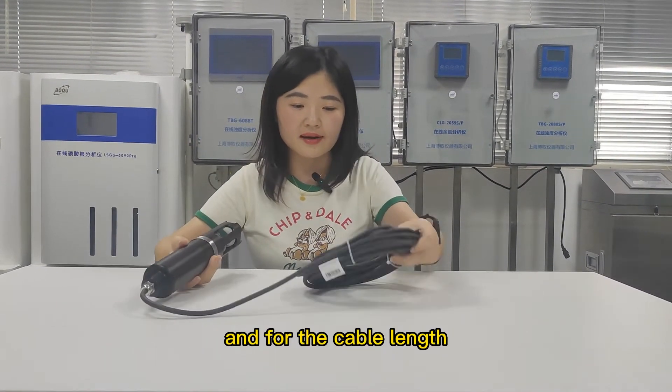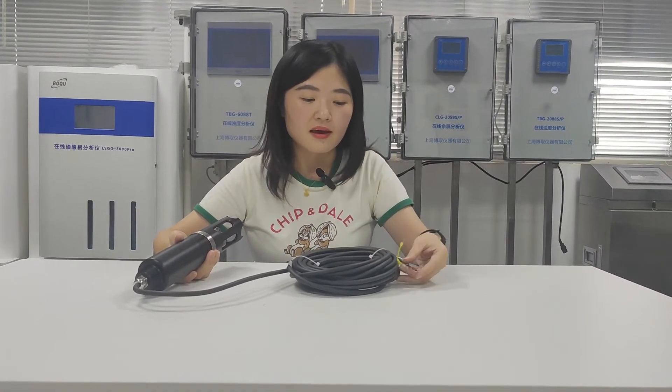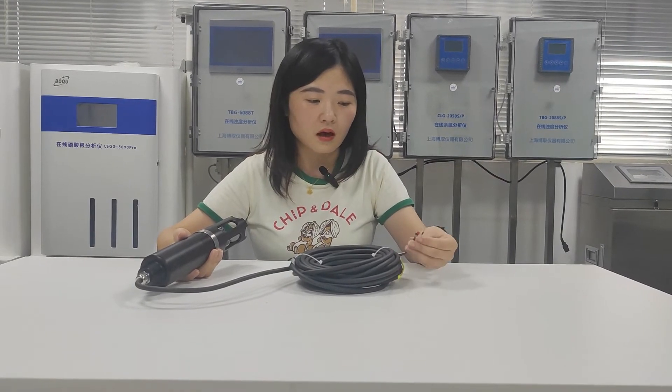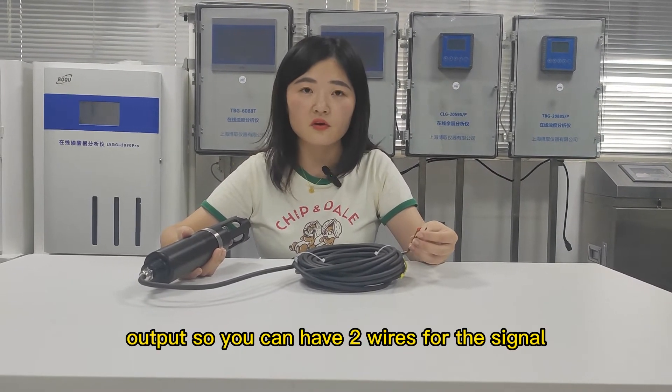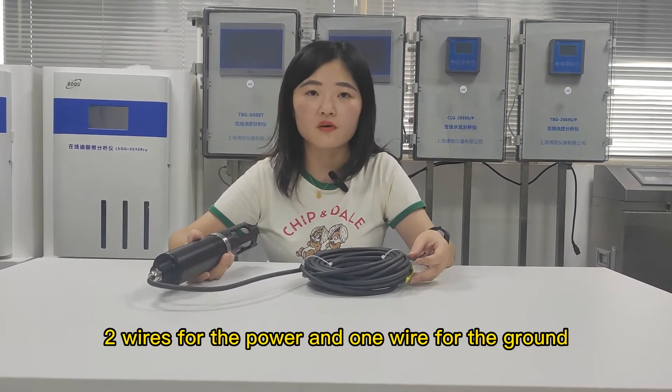For the cable length, we have 10 meters, and also five wires for the output. You can have two wires for the signal, two wires for the power, and one wire for the ground.